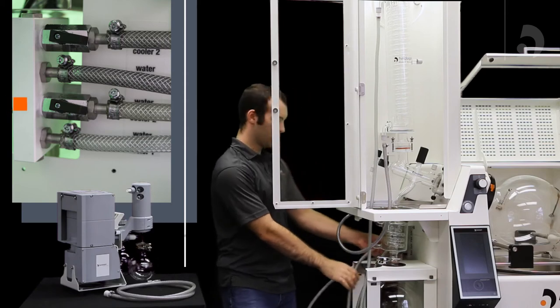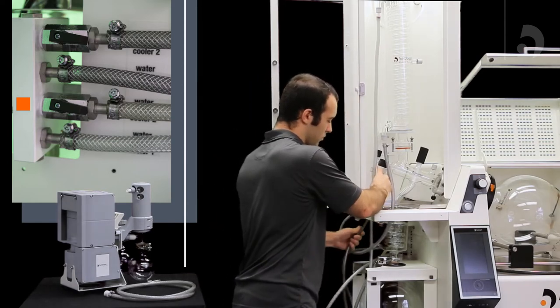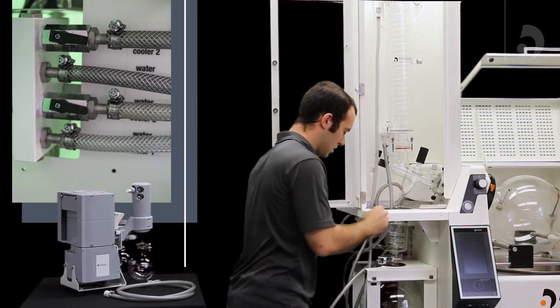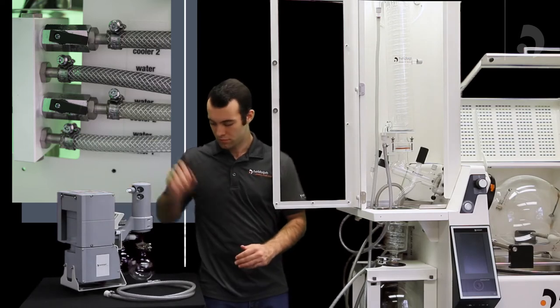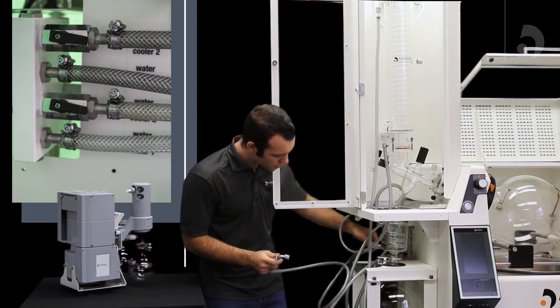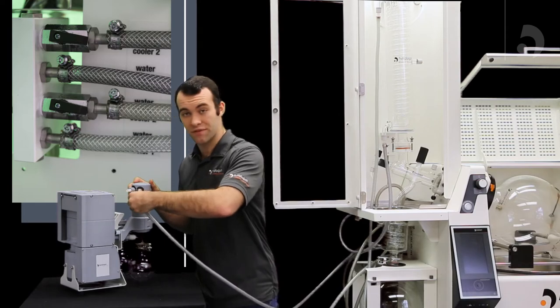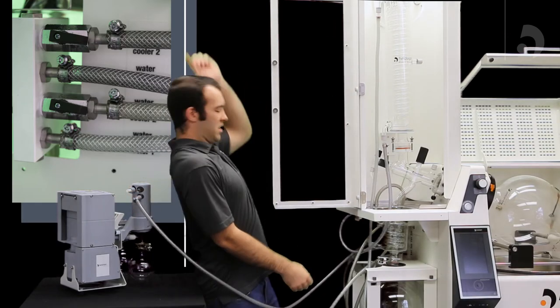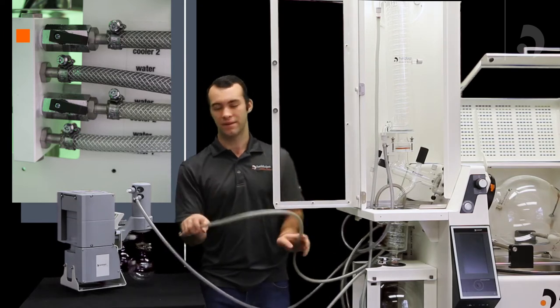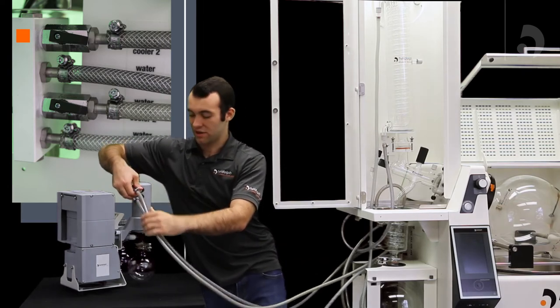Your coolant out two will go into the top of your mini condenser. From there we're going to connect that in series with our vacuum pump. From the bottom portion of your mini condenser you're going to plug your tube in and take it to the in port of your vacuum. Then, from the exhaust port of your vacuum you're going to connect it to your cooler in. That is how to set up all your coolant tubing.